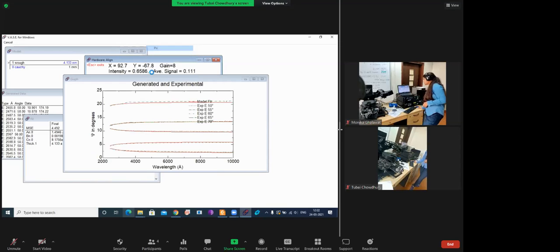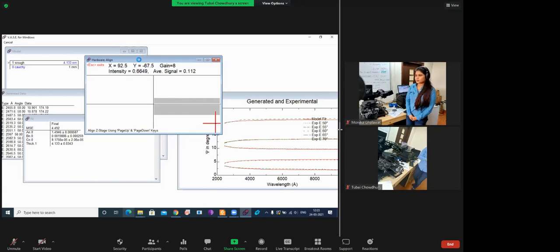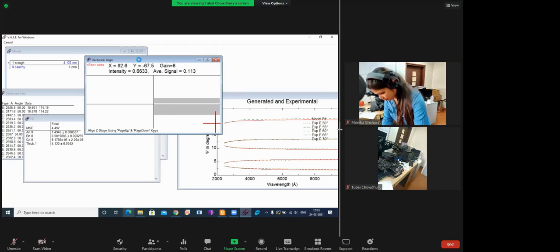Any other question? Actually, I just have a question regarding the basics. I am a little confused, can you clarify it? Suppose at Brewster's angle, the RP section goes to approximately 0. So in that case, will the delta be 0? No, approximately 0. No. Okay, I will ask my senior to explain this. Monica, please unmute, because she has explained the Brewster angle to you yesterday also.